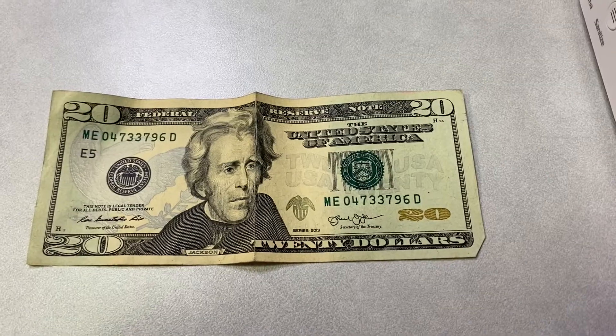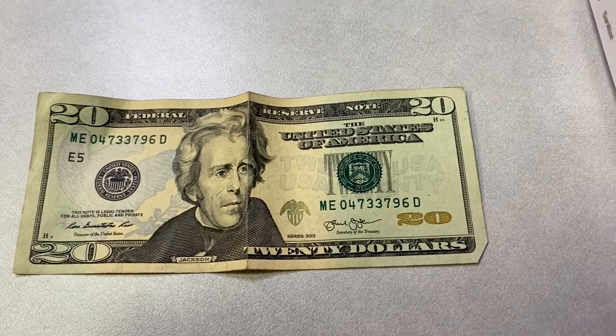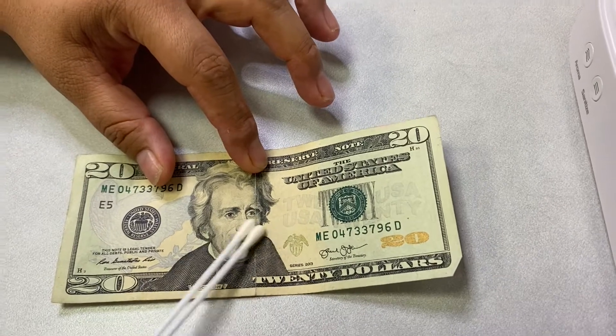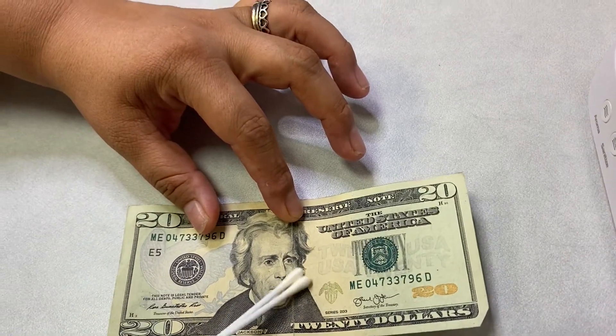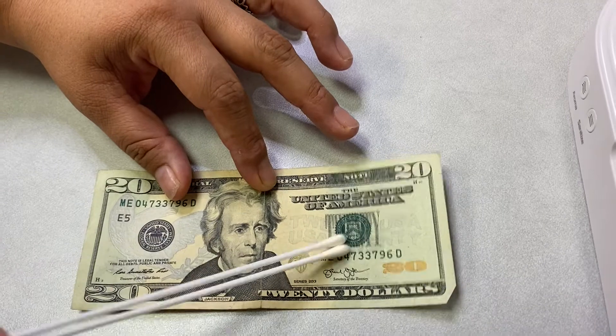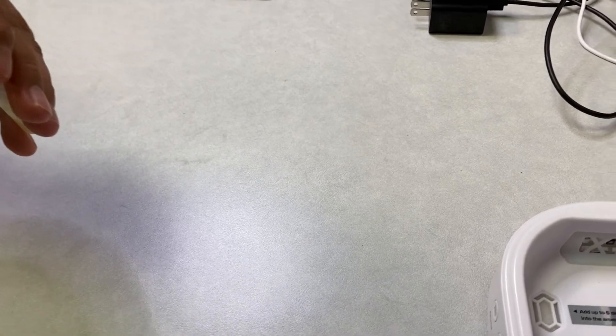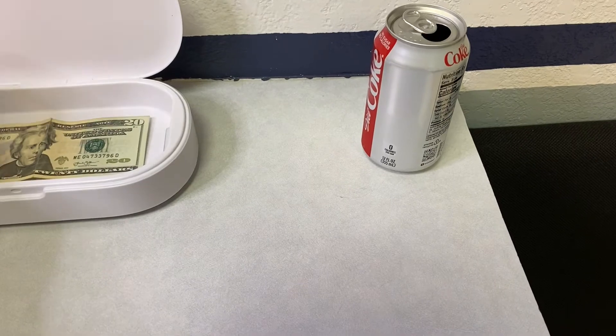We'll pull a regular $20 bill and culture the top of it, then put it in the light, get a culture after, and see how it comes out — see if it actually works. Here's the $20 bill. We're going to do the culture first before we put it in the UV-C light. Get a good culture — thank you for the assisting hand. I'll put that over here. That's the pre-culture.